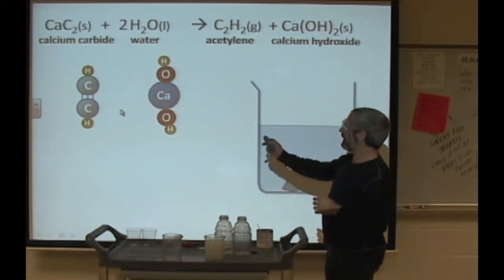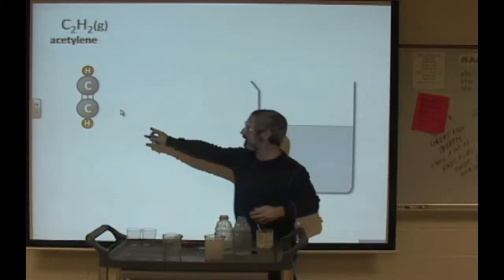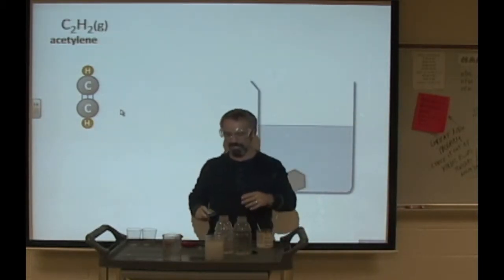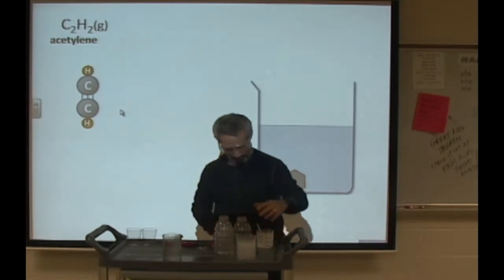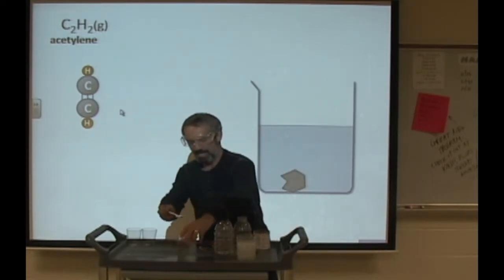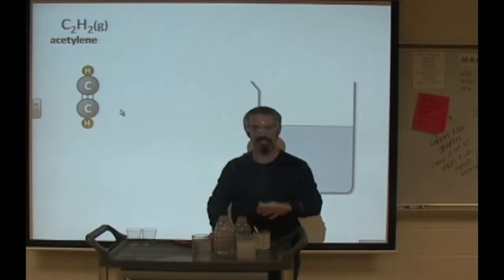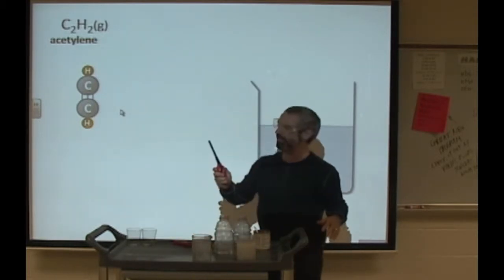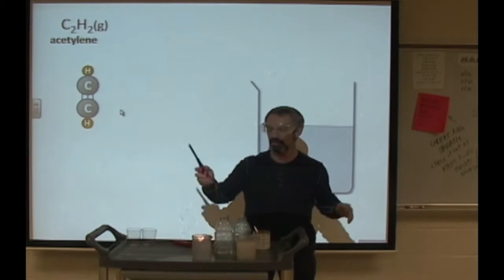Well, that's all I'm going to do. But the neat thing is, let's make a further look at this acetylene gas. I've got a second beaker here. I'll put some fresh calcium carbide in it. And now I'm going to take that acetylene gas and do a completely second reaction with it involving fire.